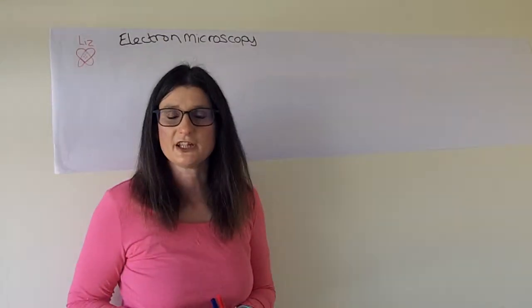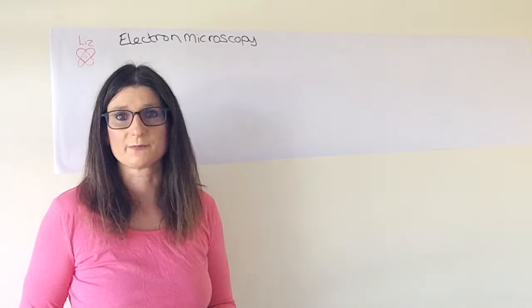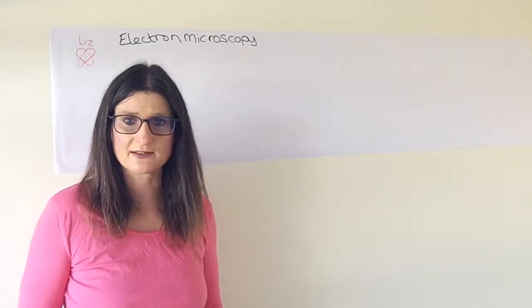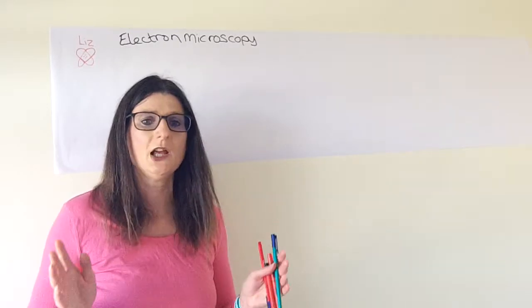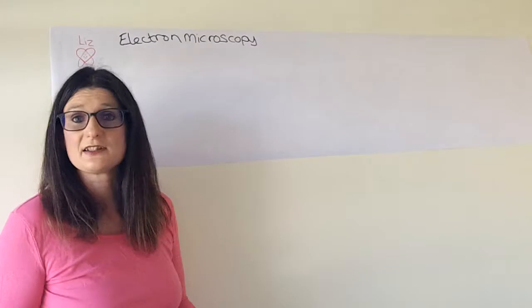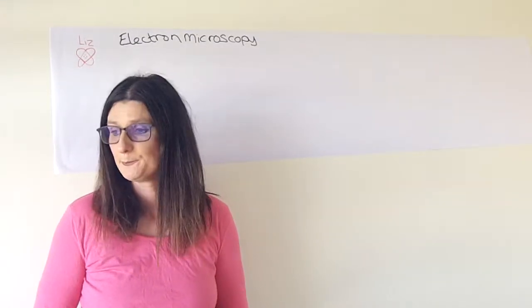I've already done a video on light microscopy, or optical microscopy as it's more correctly known. So I'm going to do a little bit of an overview on that today in case you've not seen my video, and a bit of a recap, and then I'm going to tell you about electron microscopy and why we'd need to do that.